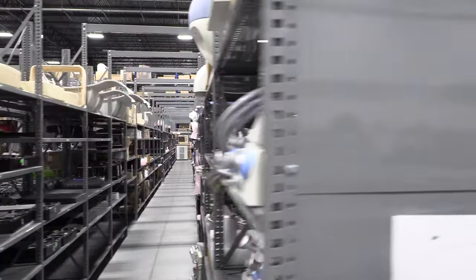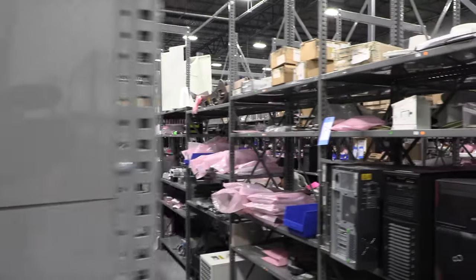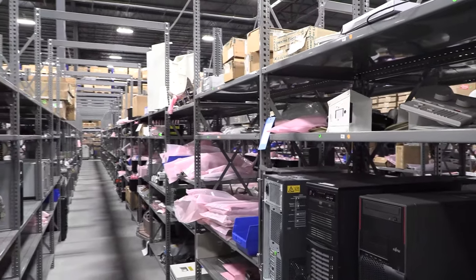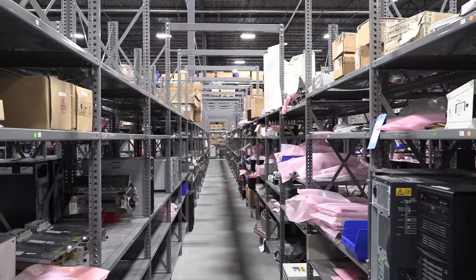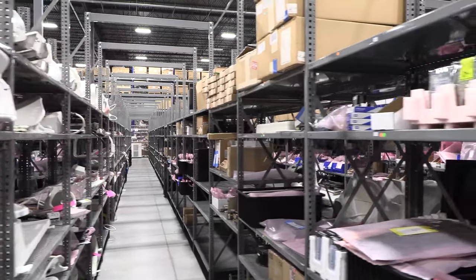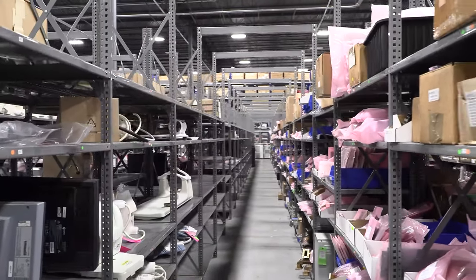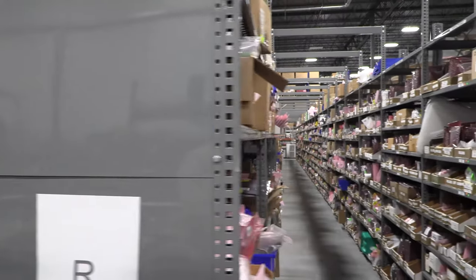But these are only some of your parts, because the larger parts must be someplace else. I always see smaller parts in the cage other than PCs. That's correct. This is our small goods cage. We do have large part storage in long-term storage. We pre-crate all of our glassware, especially for DI, so that it can go out at a moment's notice. All of that is kept in inventory in locations in long-term storage.